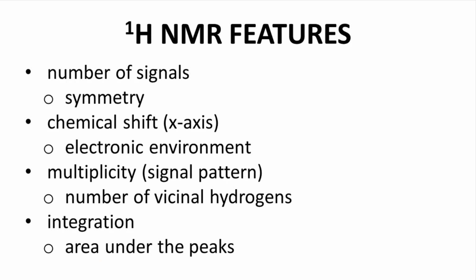Of all these features, I would strongly recommend spending some time to memorize the representative chemical shift values: aromatic CHs, aldehydes, alcohols, etc. Memorizing these values takes some time, but knowing typical chemical shifts is extremely helpful for analyzing NMR spectra.